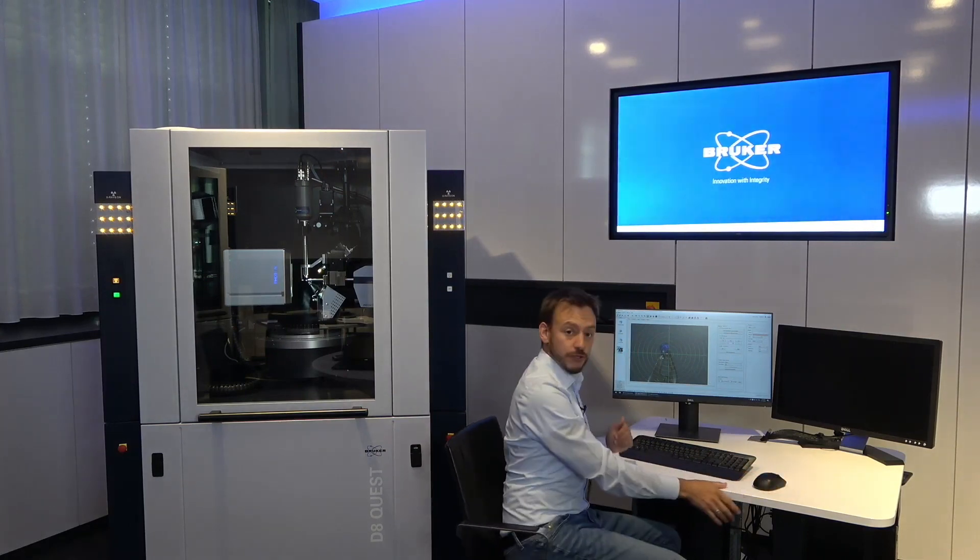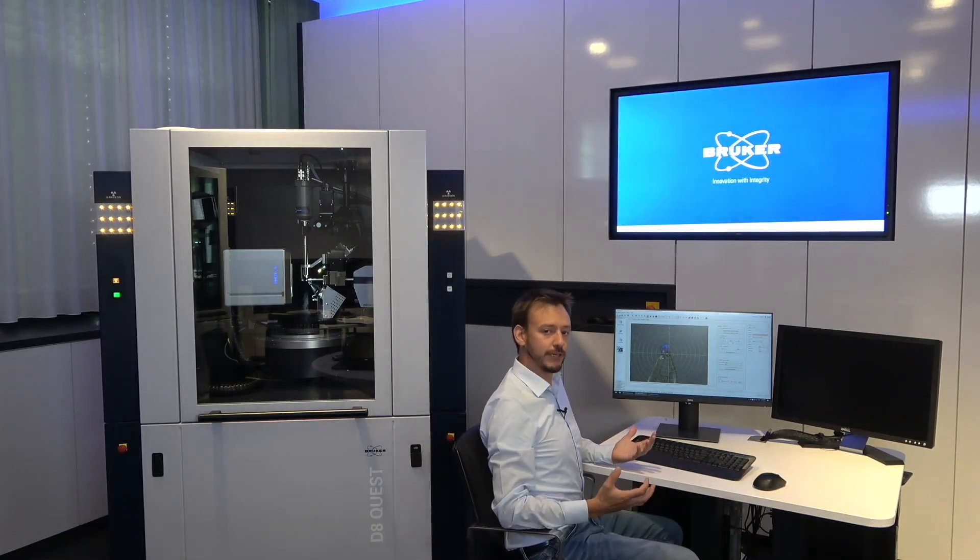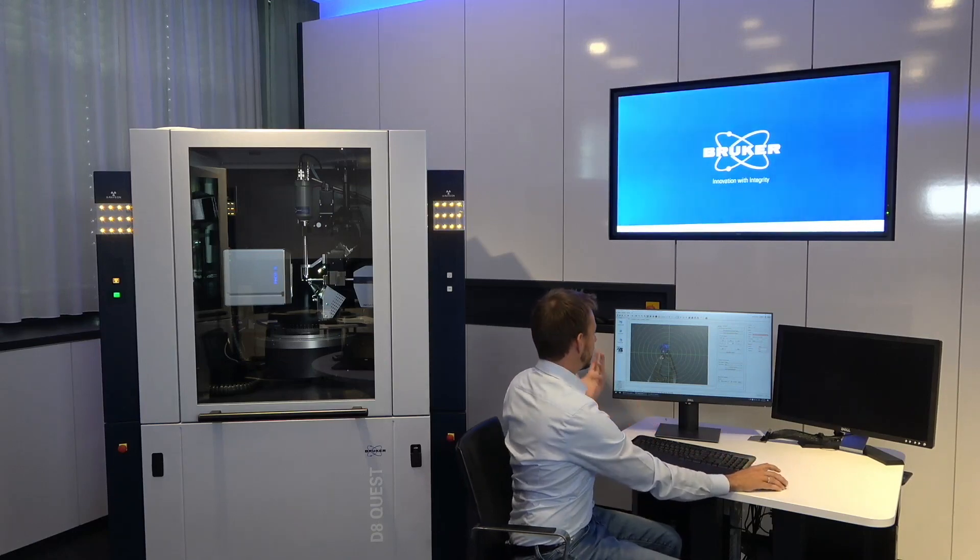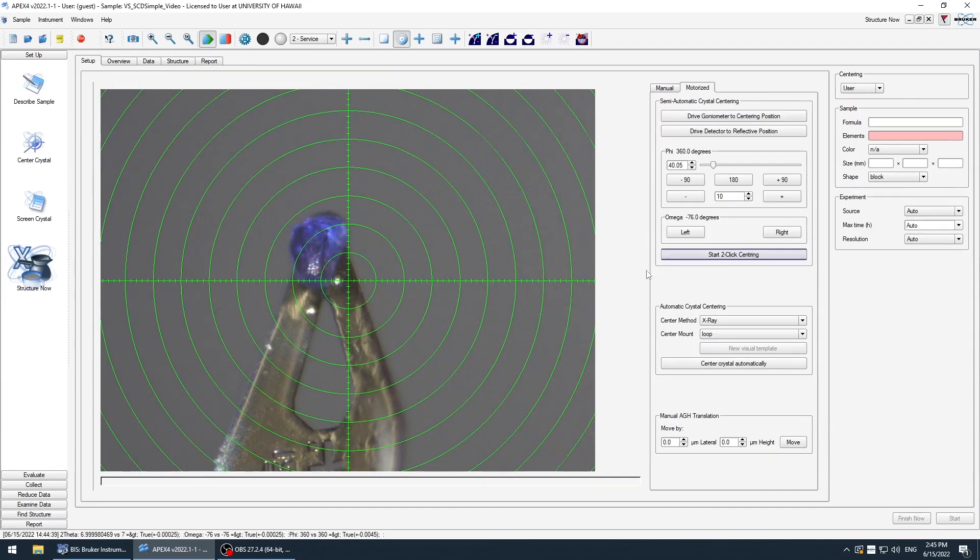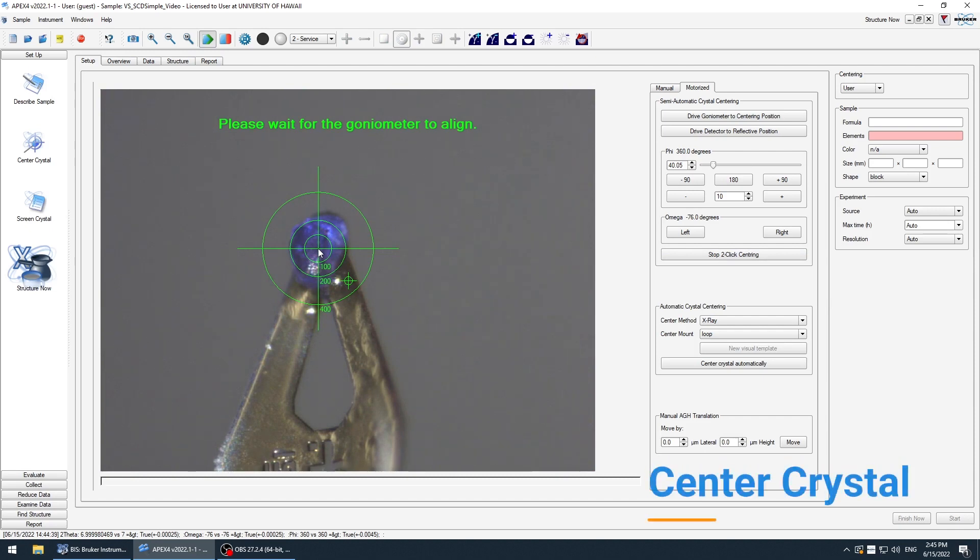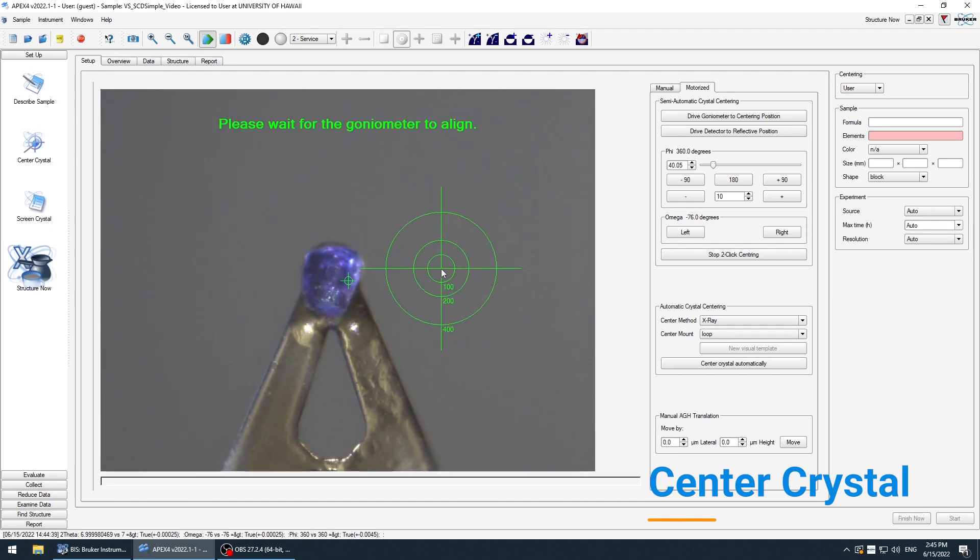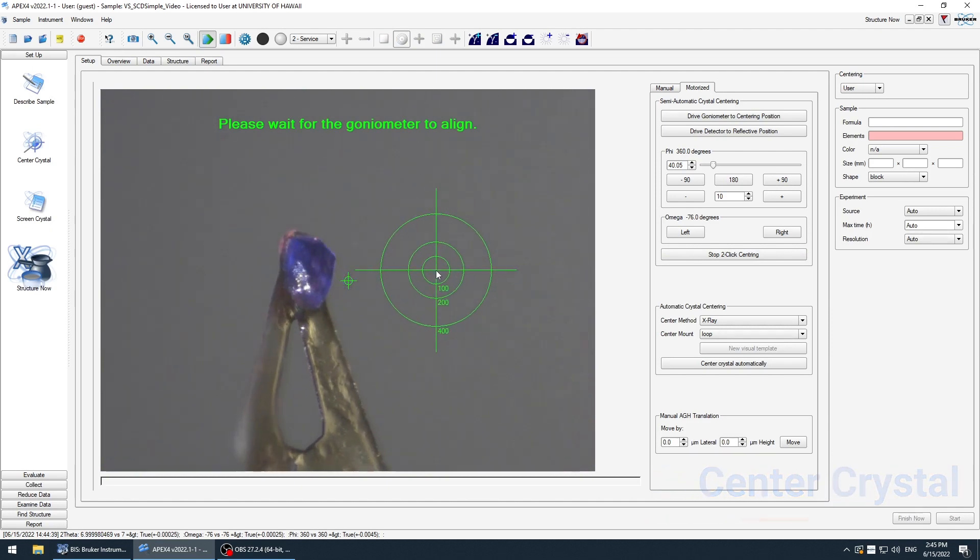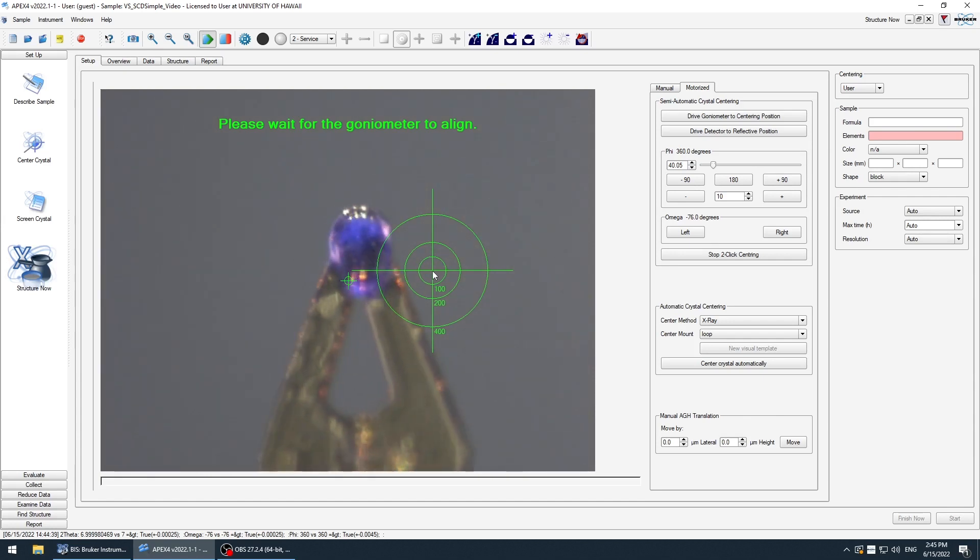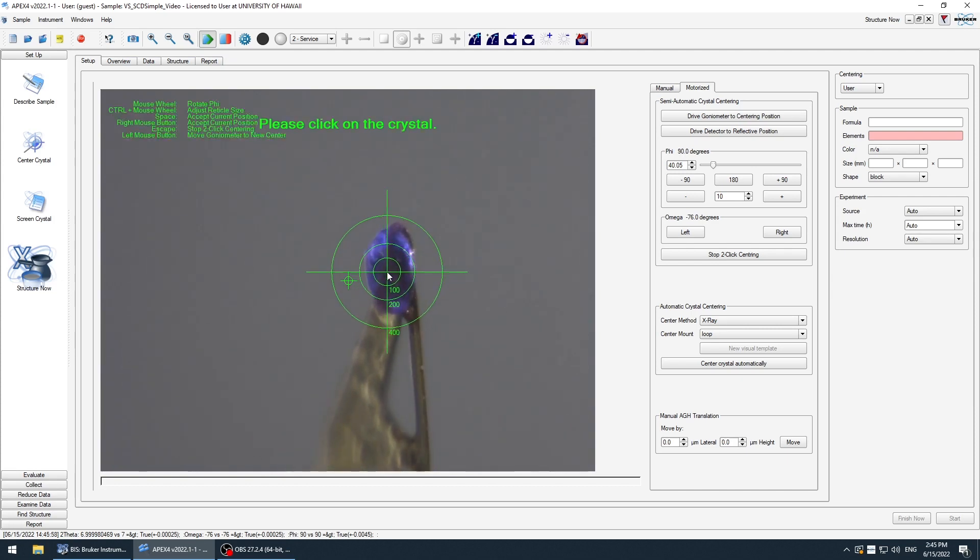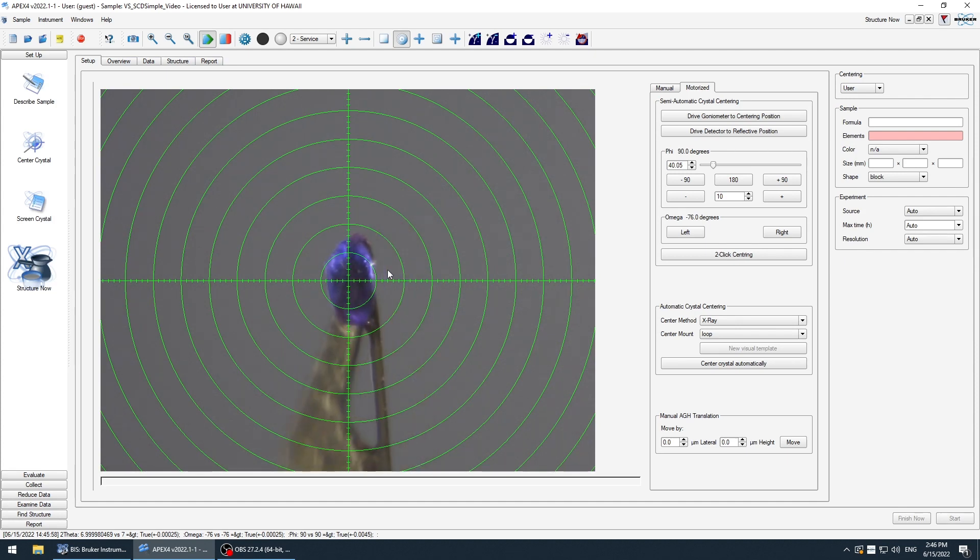I open Structure Now. The first thing we have to do is bring the crystal into the X-ray beam. This is done with the help of the automatic goniometer head. You just click the crystal, it's moved automatically in the beam. And then we have to do it in the other orientation of the crystal. And there we are.